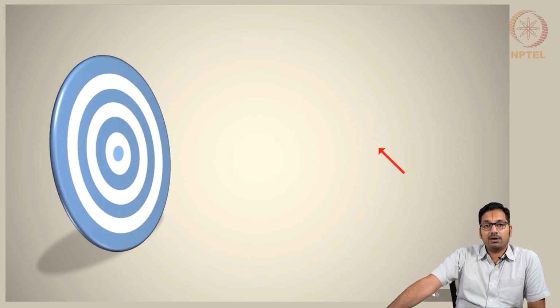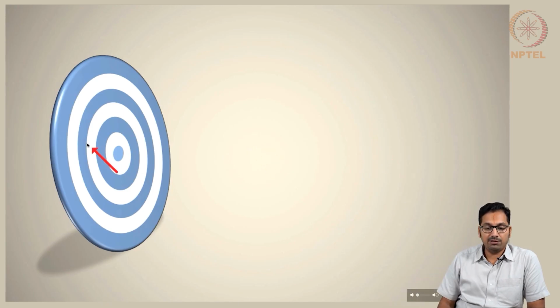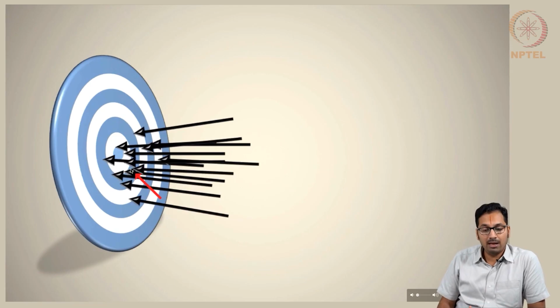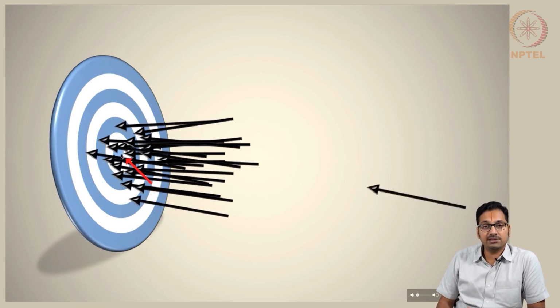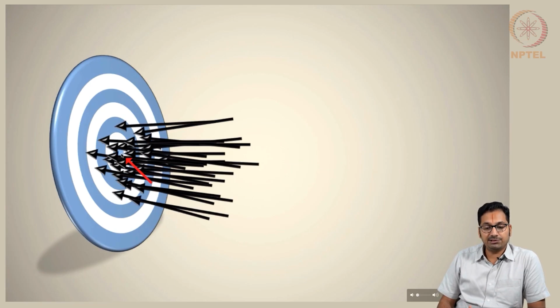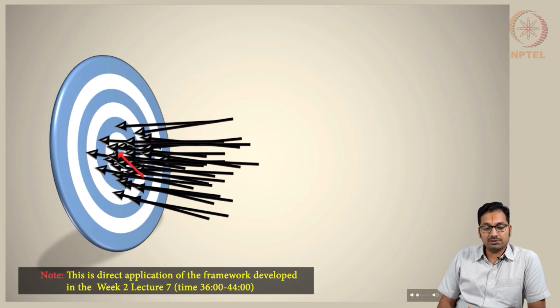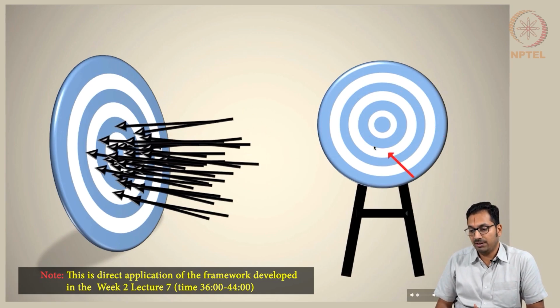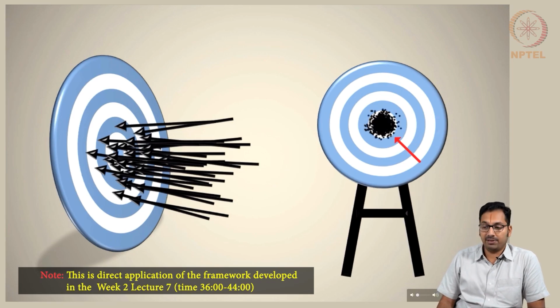Let us assume that you are trying to make a measurement such that you are going to determine how good the accuracy and precision is. As you might have remembered earlier, we will be taking an example of arrows hitting a dartboard, and let us say you want to hit right at the center of the dartboard. How are you going to achieve this? In order to do this, all the dots, if you might remember, were represented on a 2D surface, as you might end up seeing here, coming up as dots in the measurement.